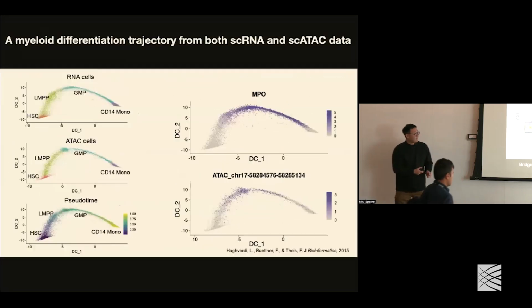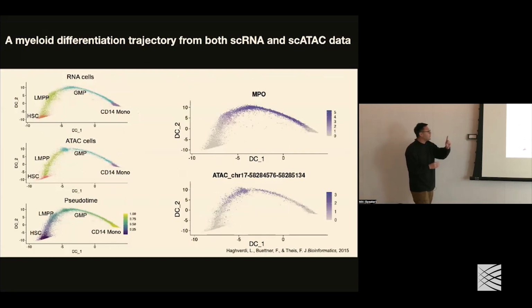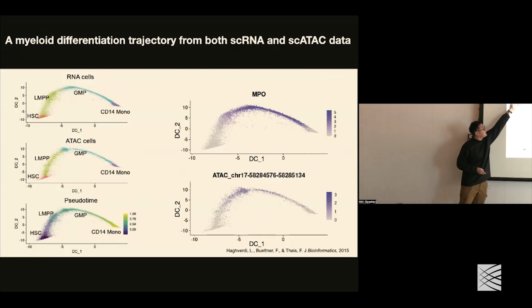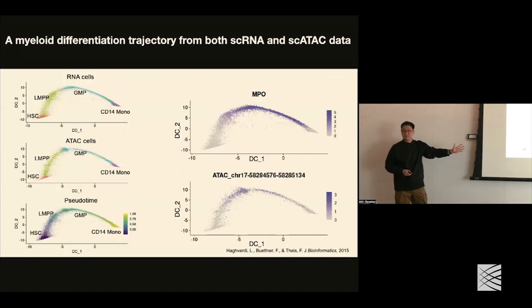Thank you. And you can see right now the ATAC-seq and RNA cells are in the same space. Then we can perform, for example, this myeloid differentiation trajectory. We built it using both RNA-seq and ATAC-seq cells. Here we're not smoothing them, so you can see those individual cells. Here are the RNA cells, here are the ATAC cells. They have those different gene and ATAC-seq markers.